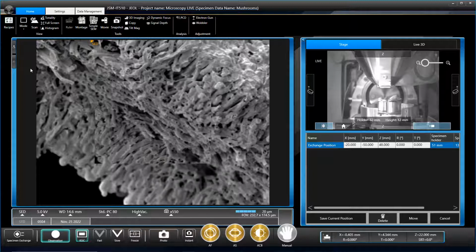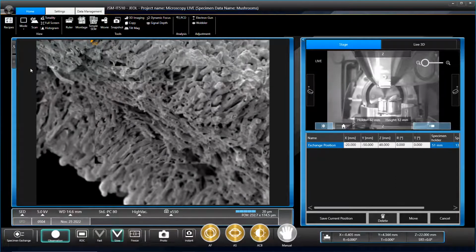I can't tell. But as we've seen, I'm terrible at focusing on anything. It's not a rock. Oh, it's fine to me.